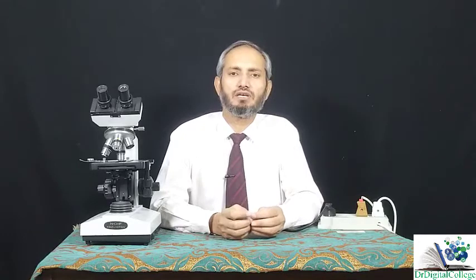Today I will demonstrate the working and the structure of the light microscope. The light microscope is very extensively used in A-levels practicals. It is also used in F.Sc. and general medical laboratories. I hope you have already studied the comparison of light microscope and electron microscope.